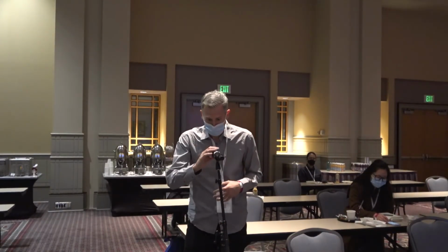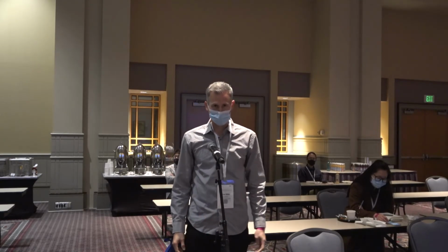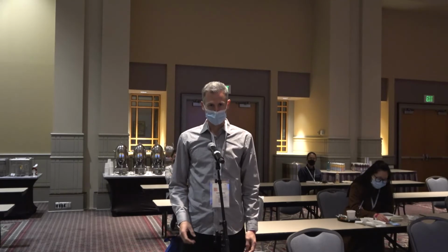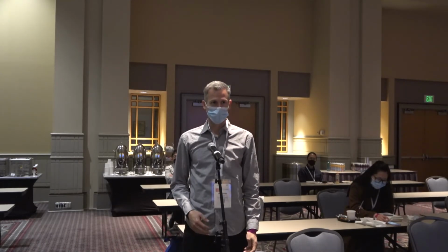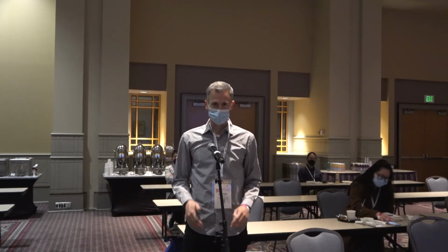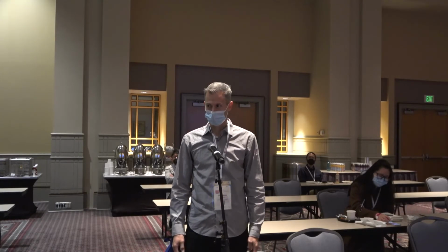Thank you both, very nice presentations. I have a question. You said that you think many PTMs are black and white, and we obviously see the same, so that's very interesting. At the same time, it's challenging for data analysis, particularly statistics. So can you elaborate a little bit whether you have been playing around with imputation strategies and how this interacts with the statistics performed? It would be very interesting to hear.